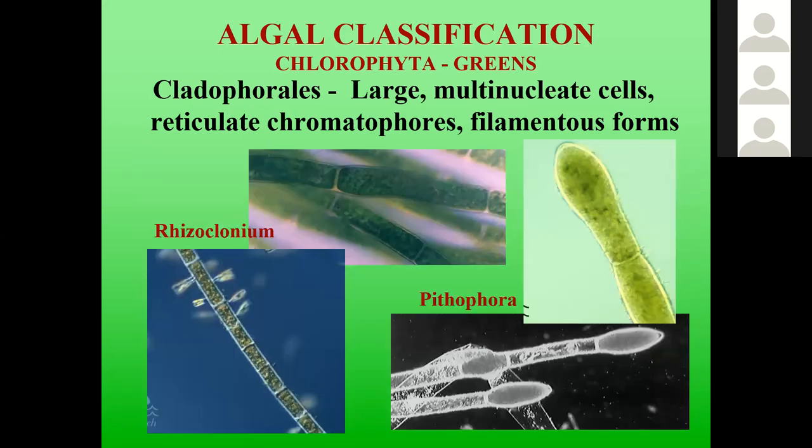Grows on things. The other two that go with it that are the mainstays of this group: Rhizoclonium, which is basically a Cladophora that doesn't branch most of the time. Cladophora always branches, well, most of the time. That's the problem, you get these gradations. Pithophora is incredibly hard to kill. It can Pithophora you off. It has this unusual sequence, usually of lighter and darker cells and a slight morphological change, usually with this bulbous end cell. All these are problem mats when they form and very hard to get rid of once they form.